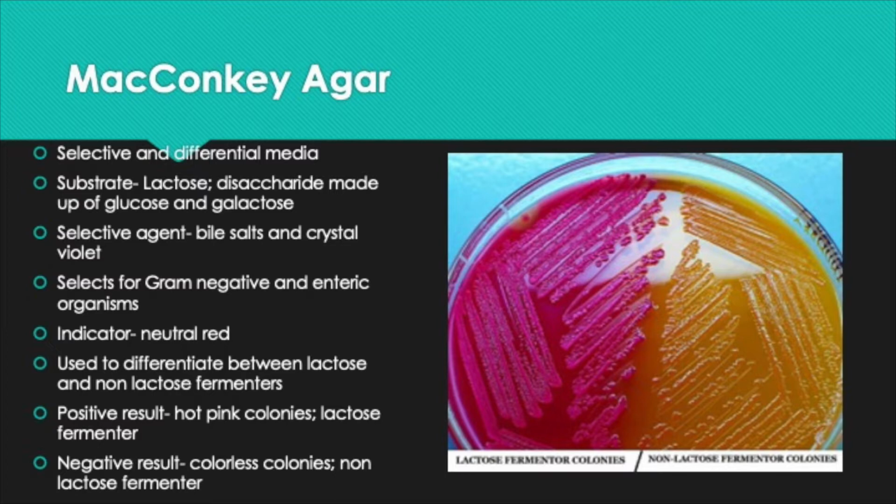So MacConkey agar, my indicator is neutral red. Now my substrate is lactose. So the metabolism part that I'm looking at is fermentation. So does the bacteria that's growing on the plate ferment the lactose, yes or no?